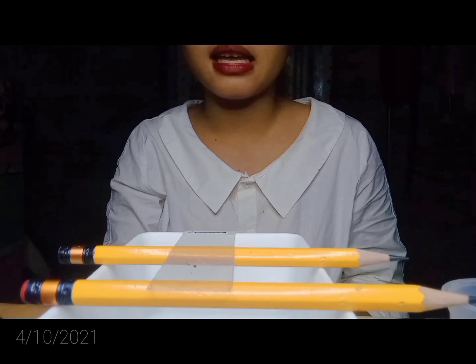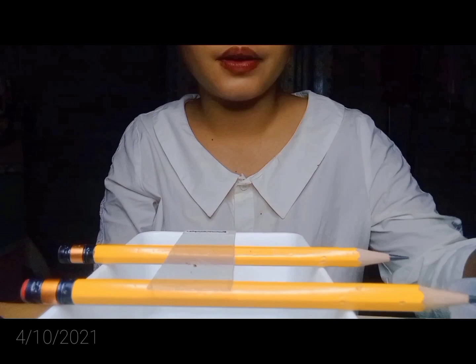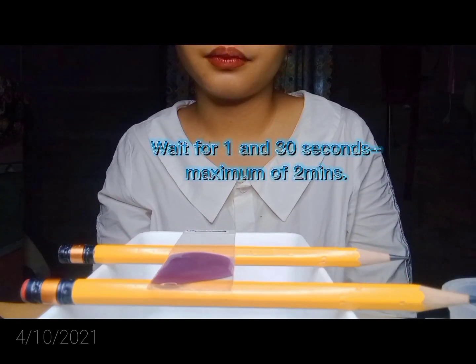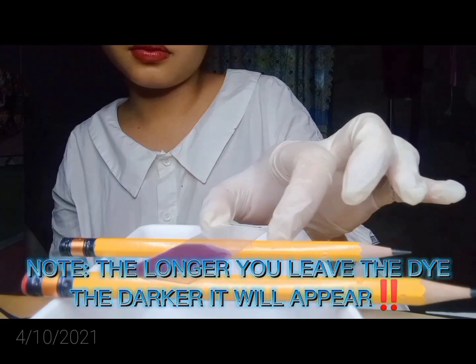So I'm back. Now I am going to perform in front of you the staining procedure, which is called Gram staining. You better listen because I'm going to do this in one shot. First, the air dried and heat fixed smear should be covered with basic purple dye or crystal violet. The longer you leave the dye, the darker it will appear.